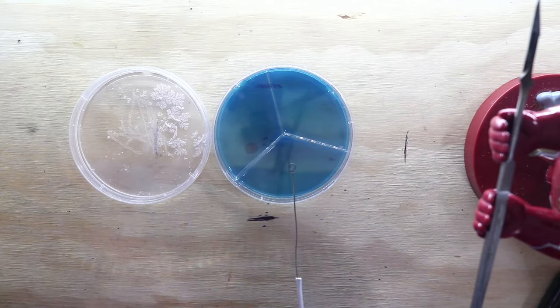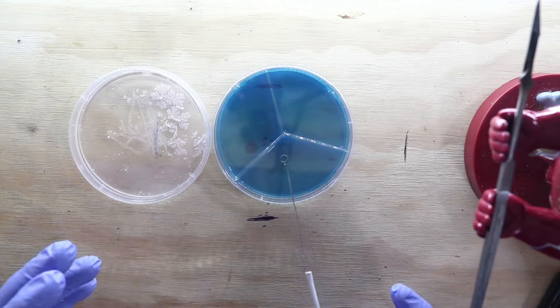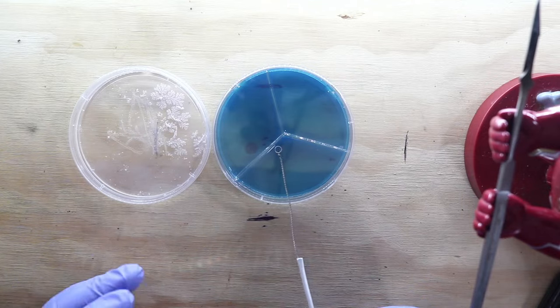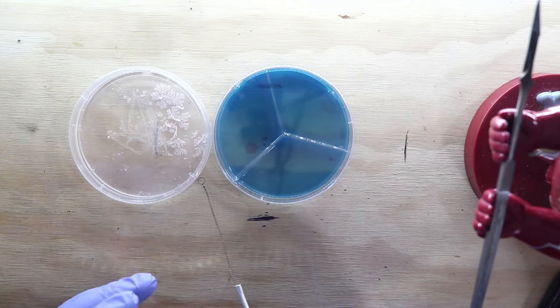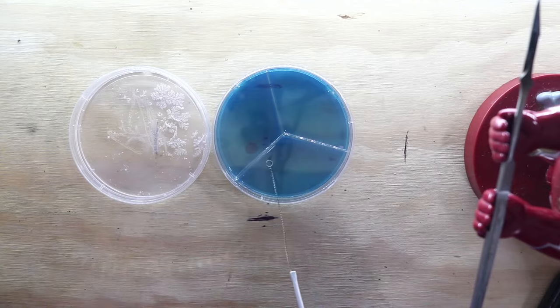It's going to be very similar to the transfers where we heat and clean, and then we're going to scoop into spores, and we're going to do a spore streak. This will be a single spore, spore print breeding. So this is a single organism being bred to itself on this one. But I will tell you, after I'm done and wrapped up everything, we'll go into how you can breed with this technique two different oysters. So, real quick.